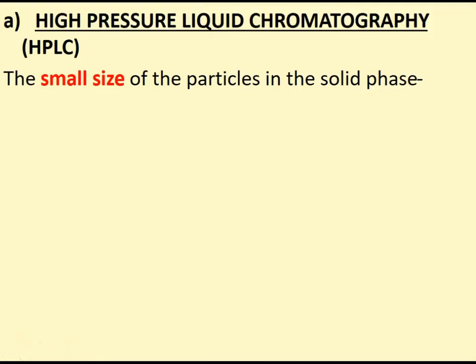Okay, so we're using high pressure liquid chromatography, not column chromatography. Last year we used thin layer, piece of paper, you might remember. So this time we're using high pressure. It's actually high performance, but we're going to pinch the P like we did with the other one and call it pressure, because you're not going to have to remember what the name of it is. HPLC is what we refer to it as. So we'll pinch the P to remember that it's under pressure.